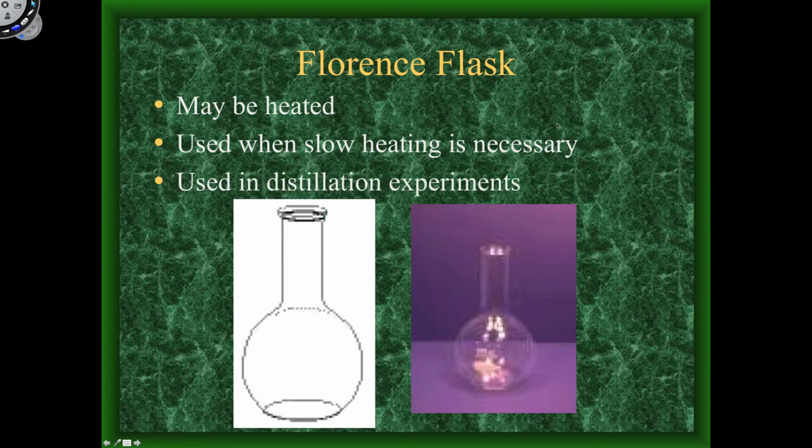Oh, and we also use the Florence flask in distillation experiments. If you don't know what distillation is, it's simply where you take different liquids and you separate the liquids by their boiling points.